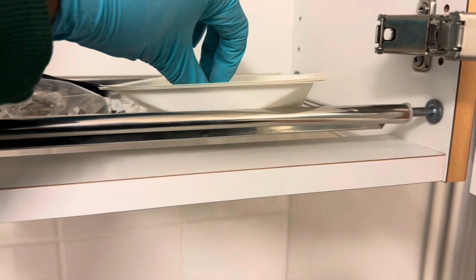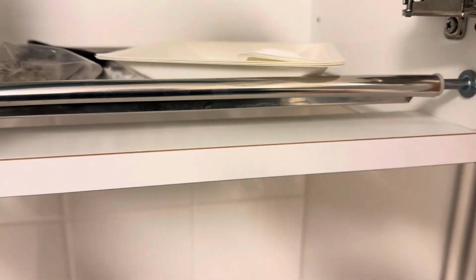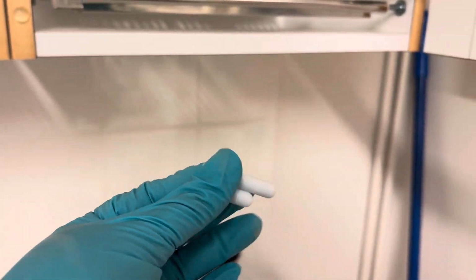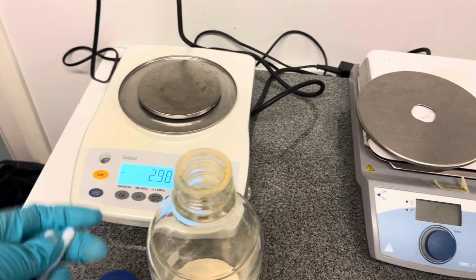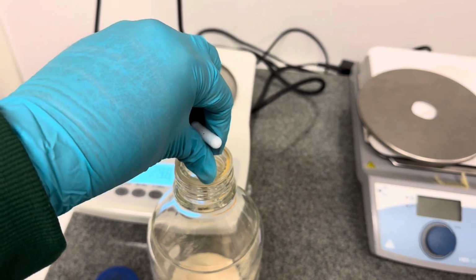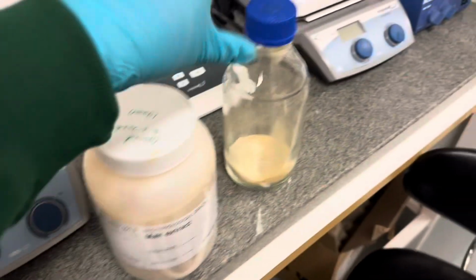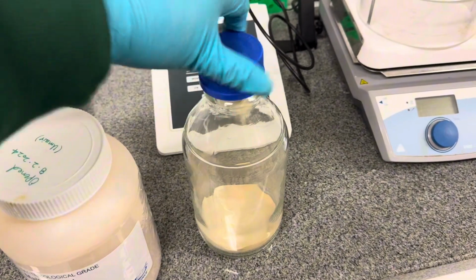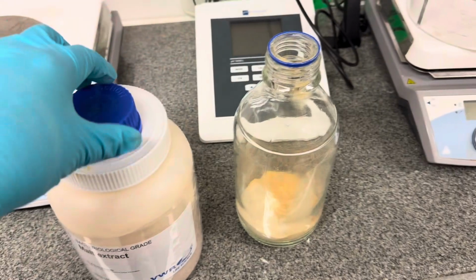The next thing I need to put into that bottle is magnetic bar, because we need to stir along with water so that it can be mixed. So we'll take these bars, magnetic bars. The purpose of including these magnetic bars is that I will just show you. Wait a moment. I put one bar here, and another bar I'm going to put into this.